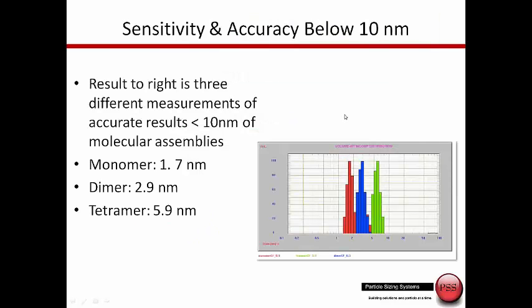This system is also very sensitive to very small particles, particles under 10 nanometers. We see three results here - three individual measurements plotted on a single graph. These were molecular assemblies where the monomer was at 1.7 nanometers, the dimer was at 2.9, and the tetramer at 5.9. The NICOMP very accurately shows these three different sizes right in the range where they are expected for this particular molecular assembly.